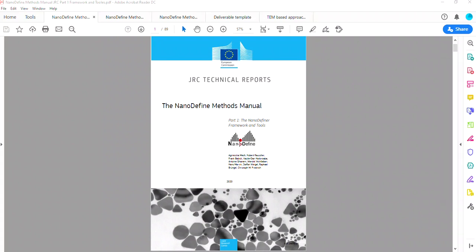Hi everyone! This is a tutorial to use the nano-defined plugin for ImageJ in order to analyze transmission electron microscopy images of nanoparticles.